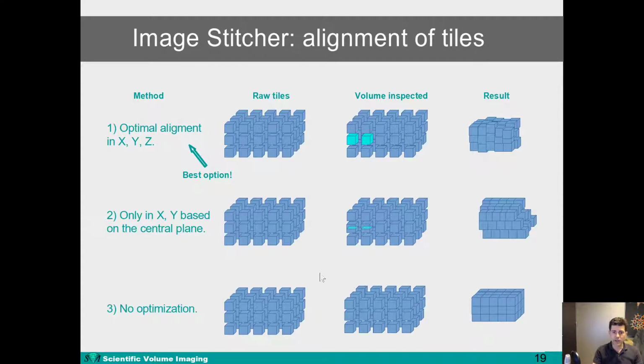Additionally, we have added options for filtering out hot and cold pixels during the optimization stage. This will not change the final intensities of the stitched image, but will help with finding the optimal tile positions when the acquisition system is affected by hot and cold pixels.